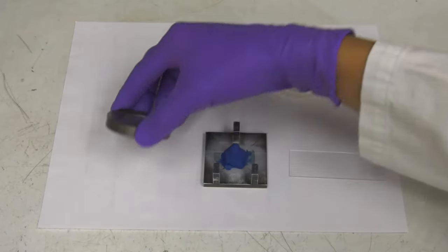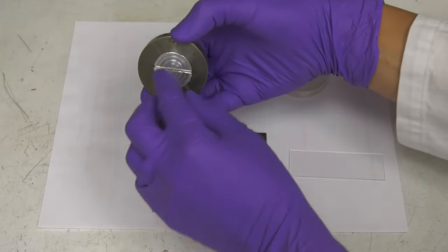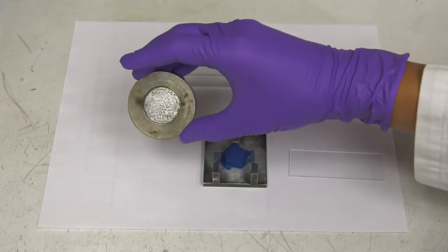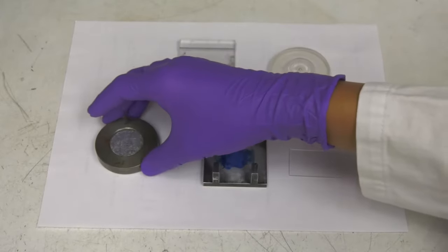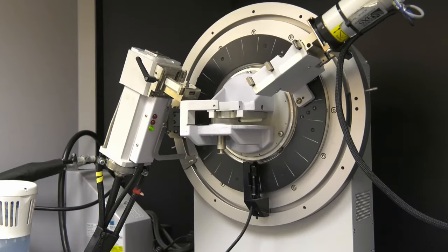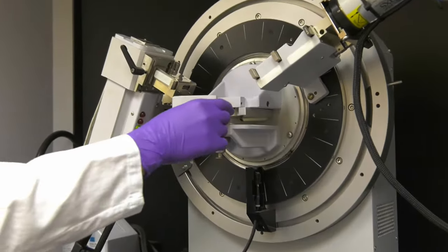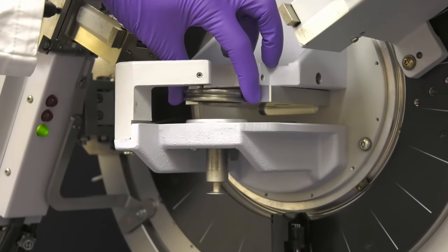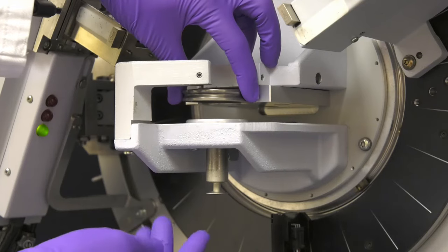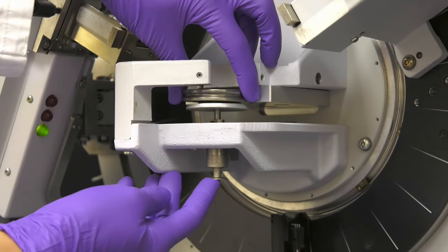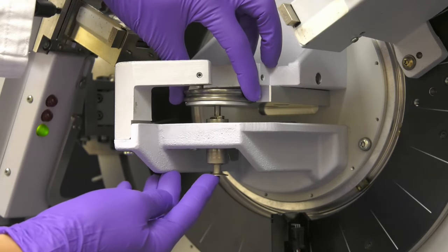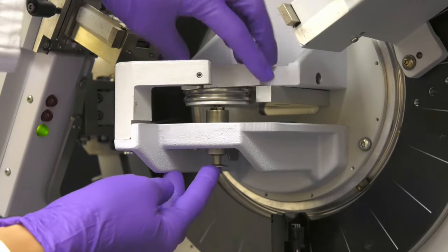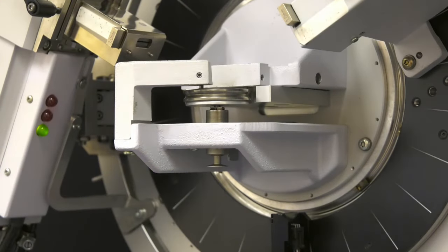This sample holder has an adjustable stage to change the height of the sample. After loading a sample, the sample holder is placed onto the base of the sample stage fixture. The sample holder is lifted up from above so that its top surface is flush with the top of the sample stage. Then, the sample stage fixture is gently pressed up, locking the sample holder into position.